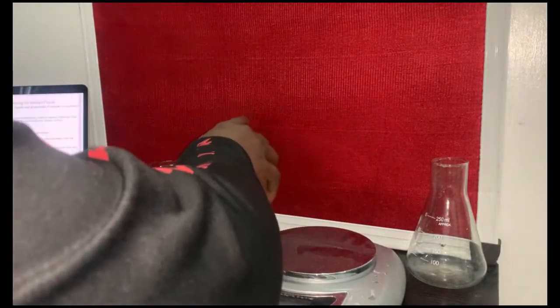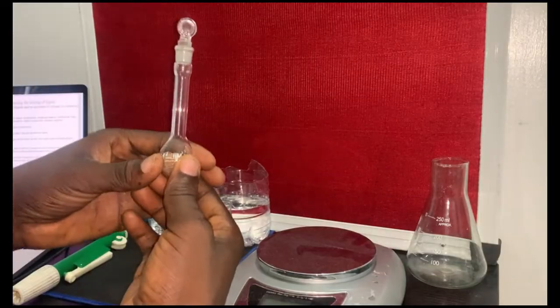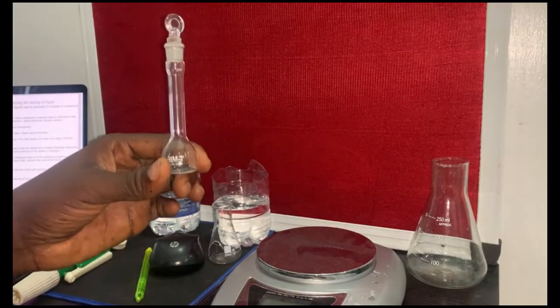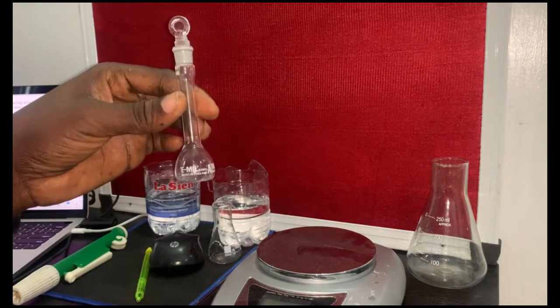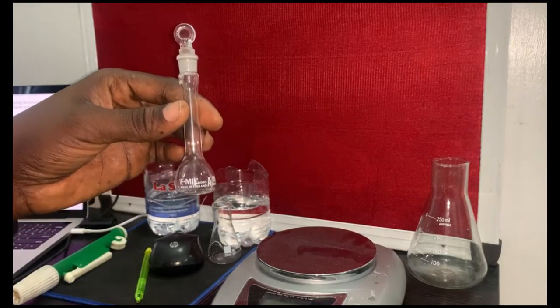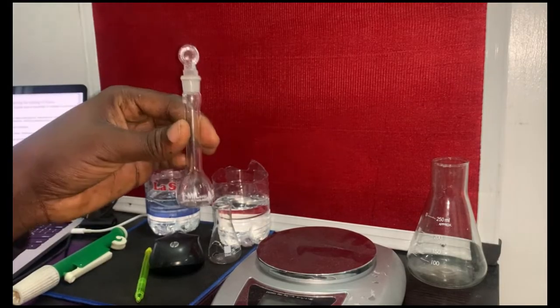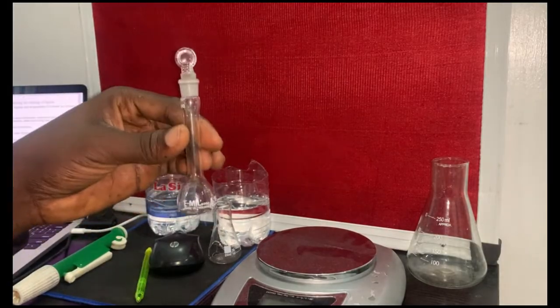Now moving further, we have our volumetric flask. If you notice this volumetric flask, you can see the size and the shape. Vertically, we have this neck projecting up, and then we have the base, which is a bit large. This is a 10 ml volumetric flask. In your manual, they requested that we make use of 10 ml. But most times in the lab over the past years, they sometimes ask you to use 25 ml. Whether it is 25 ml or 10 ml, if you follow this video, you should understand how to make use of it. So when you get to the lab and get hold of 25 ml, you should be able to do it as well.